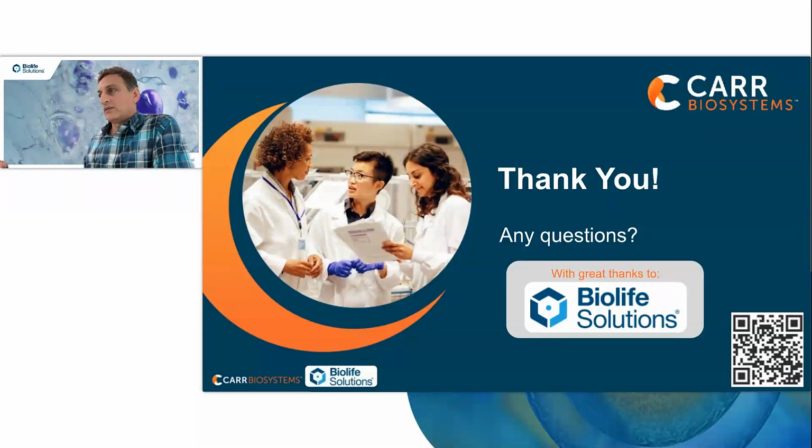We had enough parameters before we could add more, and we didn't want this to balloon into something massive. As it is, it has a number of arms. But we can certainly look into the stability of the leukopak before and after formulation.